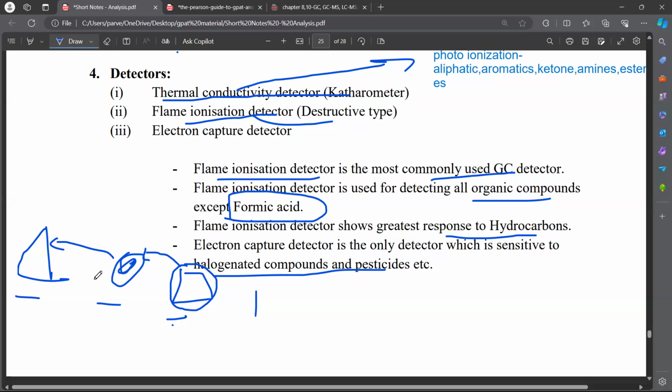because the sample in gas chromatography is always in the vapor phase. It is not in solid or liquid phase. So by modulating the temperature throughout the chromatographic column, the sample is separated well and it also prevents the decomposition of the sample. I think it is clear. Basically, it is the same as gradient elution, where you program the polarity of the solvent, while in temperature programming, you program the temperature. Is it clear? Yes, sir.